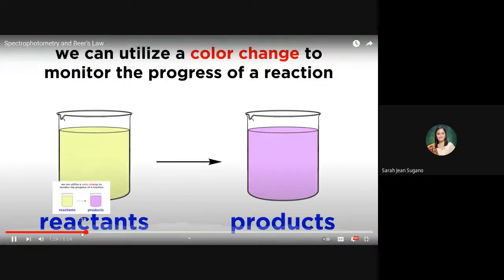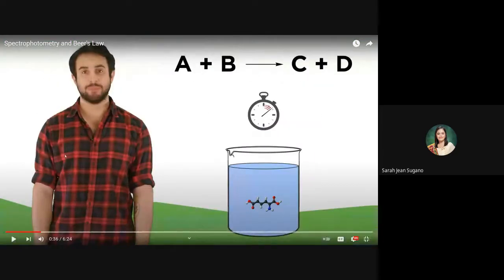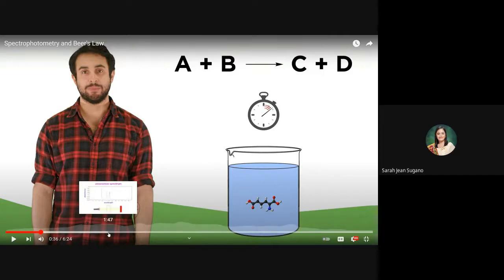Okay, let's go. As you have class, the absorbance is used for determining the concentration of a given solution. When the product itself is homogeneous in the liquid, so it's not a form of gas or a form of solids, but just the same throughout the solution.